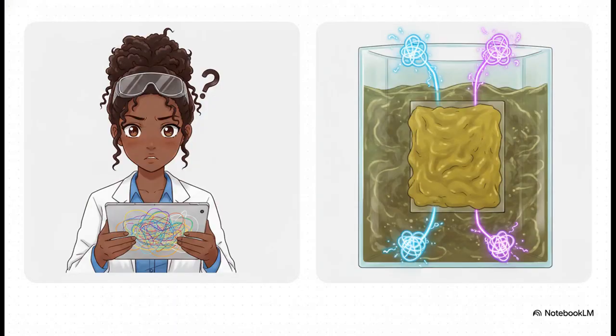Now, DC testing is fantastic for general corrosion. It's rapid, real-time, and super easy to analyze. But there's a pretty major limitation here. If your sample has an electrically insulating coating, or if it's sitting in a really low conductivity solution, the DC method kind of falls apart. The measured current ends up capturing the total resistance, including the resistance from the solution itself. This totally muddies our data, because it captures everything instead of just the specific polarization resistance we actually care about.